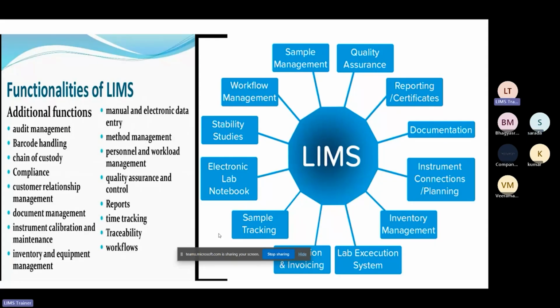Then the method management, where laboratory methods and analytical methods are managed. When we prepare some master data, all the records will be with this software, so we need not prepare it from time to time, and we can rely on this method management.